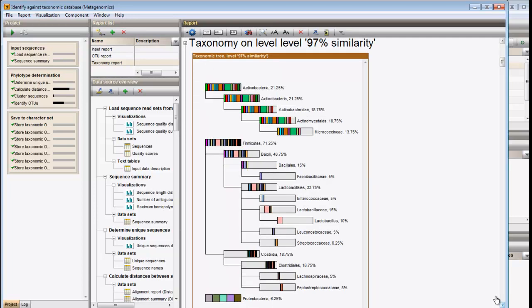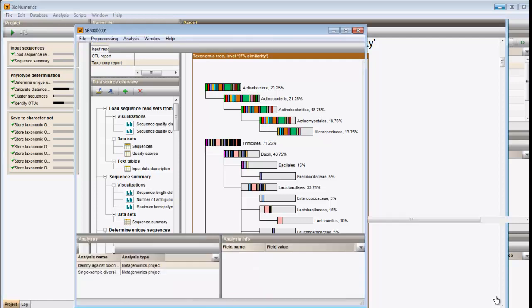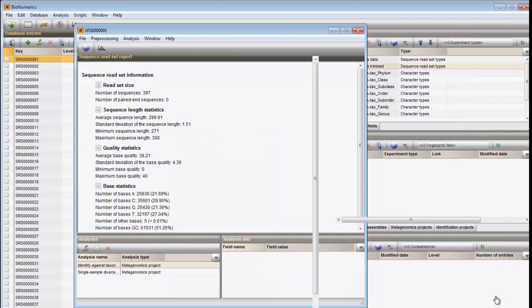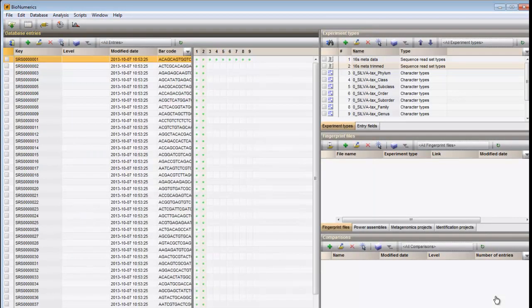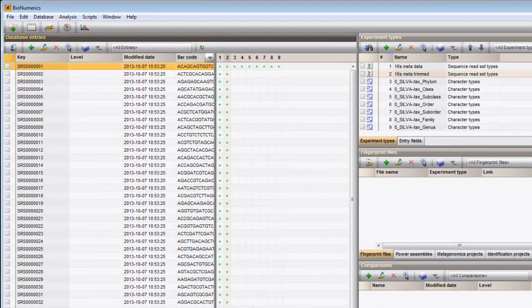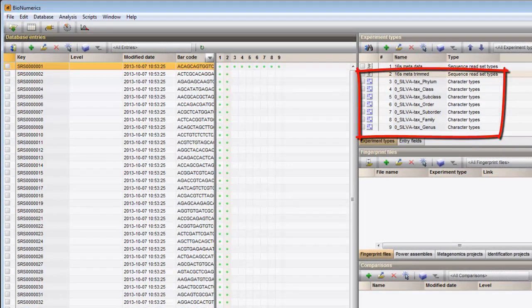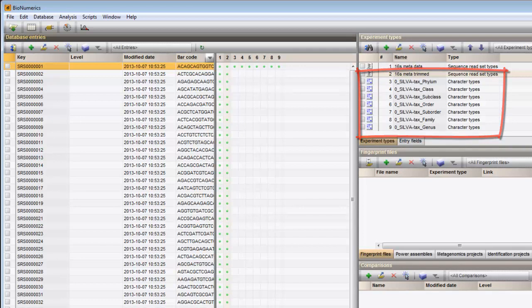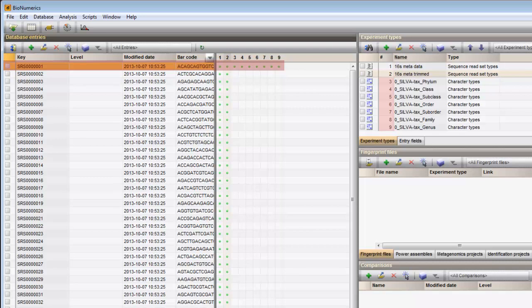When we close the Taxonomic Tree window, the tree in the report is updated to the customized visualization. To complete these results, the corresponding Single Sample Diversity Analysis can be calculated as well. For more information on this type of analysis, please watch our movie on Single Sample Diversity Analysis. When closing the Metagenomics window, we return to the main database view, where we can have a look at the character experiments that were created. In the Experiment types panel, a new character type is now listed for each of the phylogenetic levels that was used in the analysis. For the database entry that was used in the analysis, we see that the OTU abundances were saved as character data in the database.